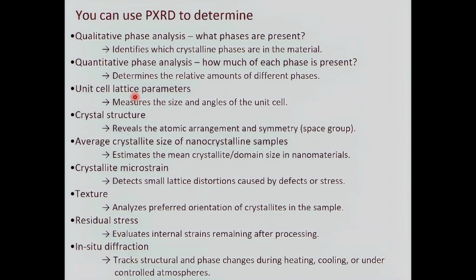And to end with the Rietveld method to refine it and obtain the final crystal structure.